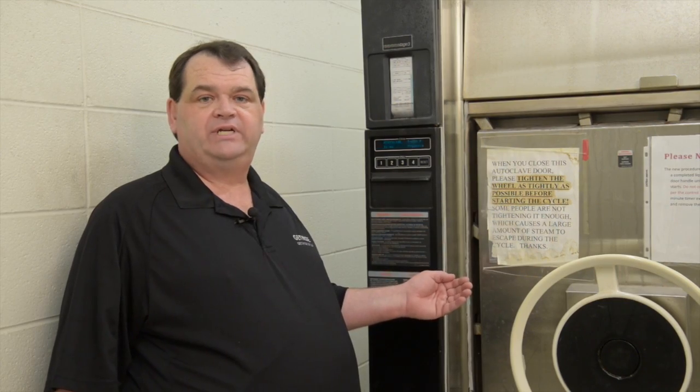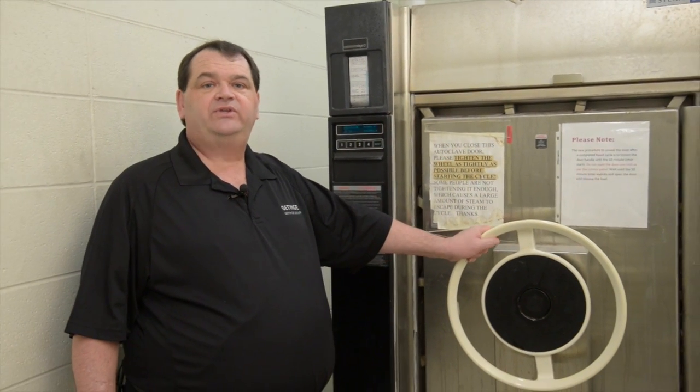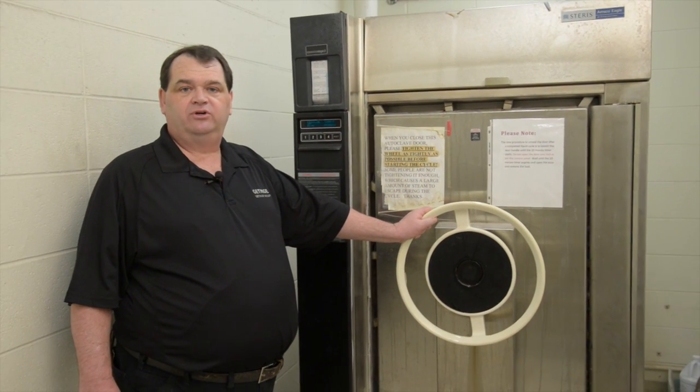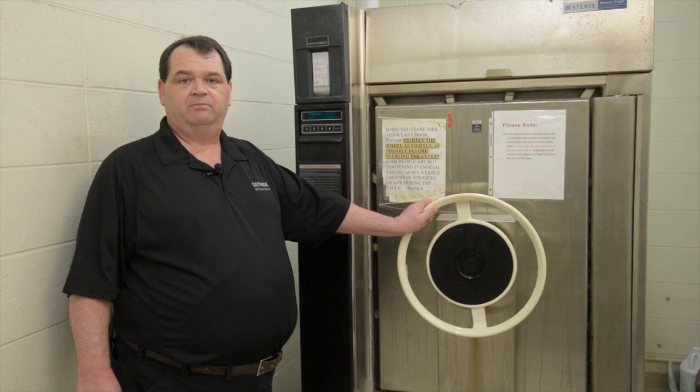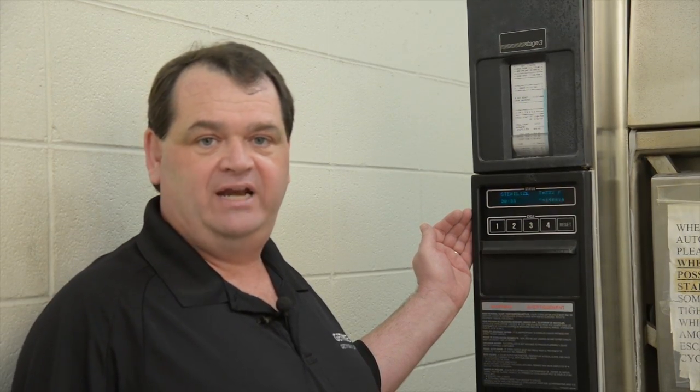This is the AMSCO sterilizer on the third floor. It's virtually the same as the one in the basement, only it has a larger door. This door requires more strength to close — if you're unable to close the door properly, please seek help. This is a Stage 3 controller; operate it just like the one explained earlier that was located in the basement.